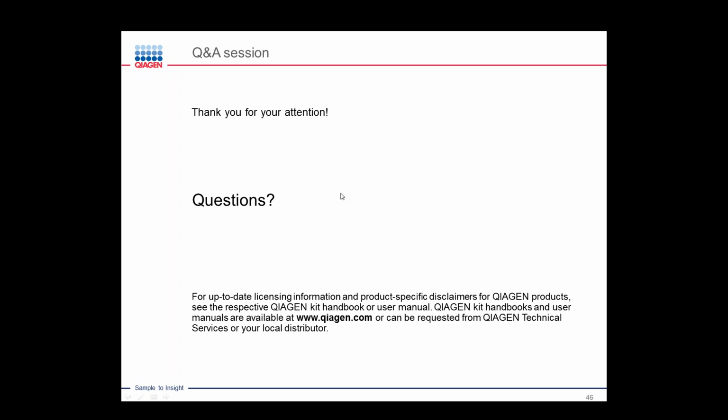Just a short additional information. If you want to work with blood or want to prepare plasma from your blood and you rely on a doctor in a hospital, it's very often that these doctors have a fixed set of blood collection tubes. And in a bad case, they're using heparin, because any downstream assay for a clinical parameter needs heparin-treated blood, and then you have to live with this heparin.